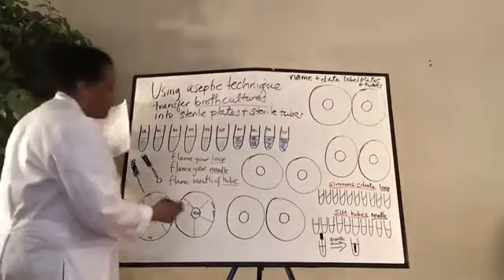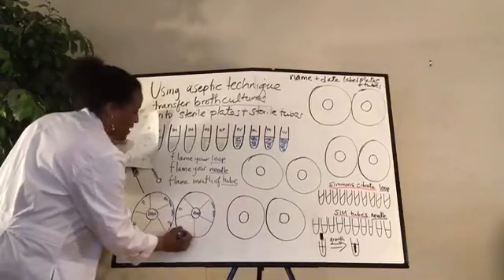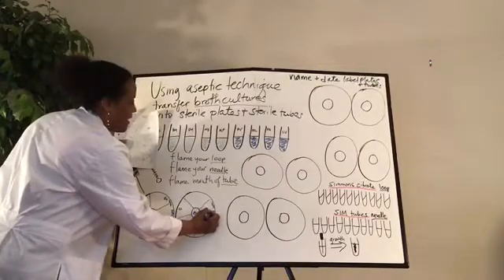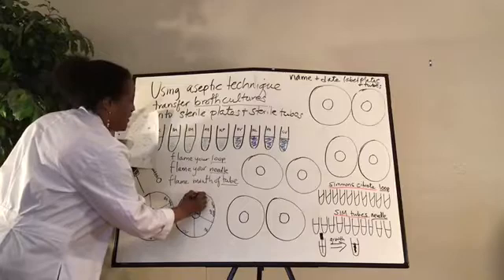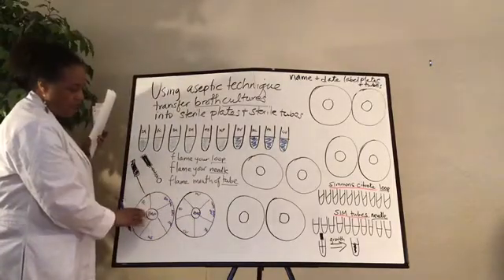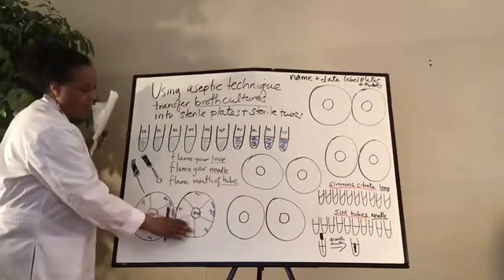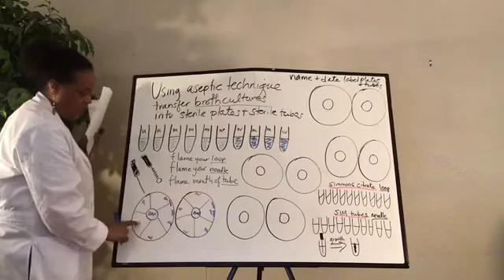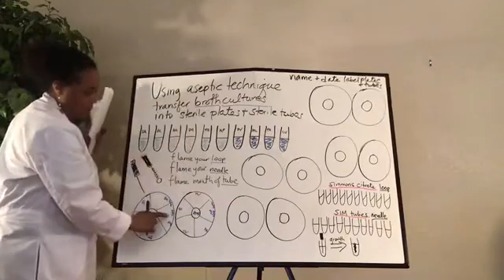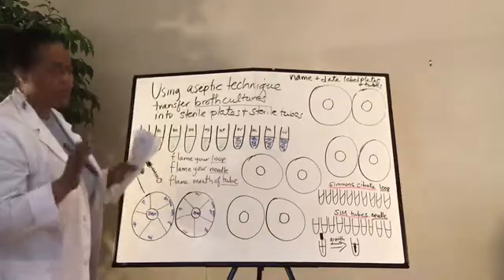This one will be KP, CV, PA, ML, and PV. So now we have all the bacteria that we're going to inoculate in these sterile wells. We have it all labeled, so we'll know that SA goes here, EC goes here, BM goes here, SM will be here, MS will be here. So make sure it's in that order, please.